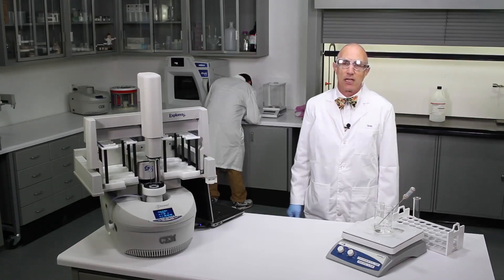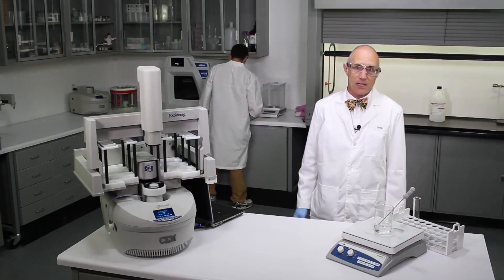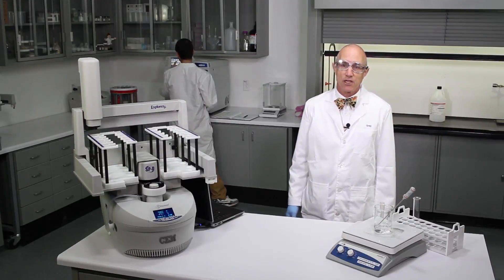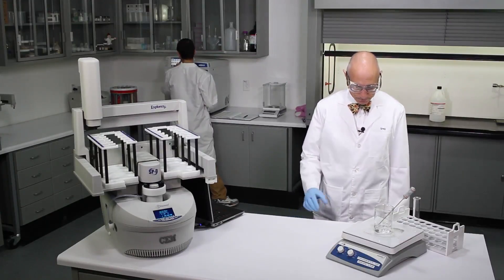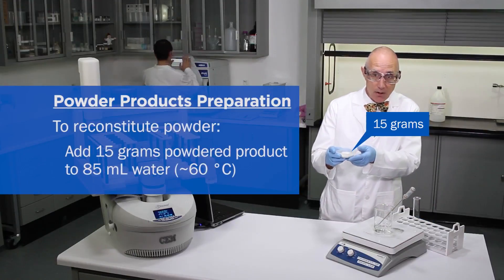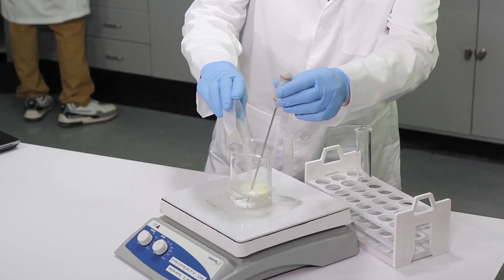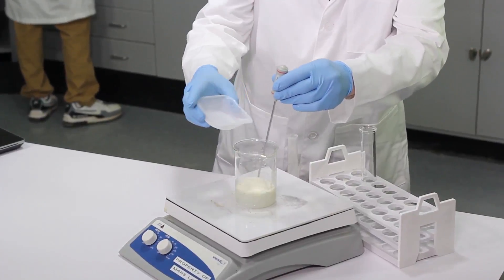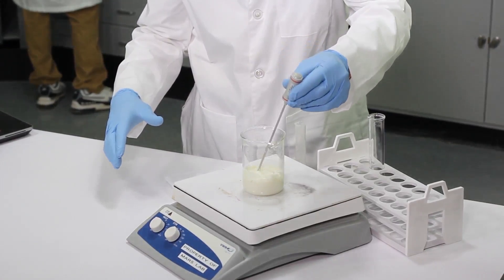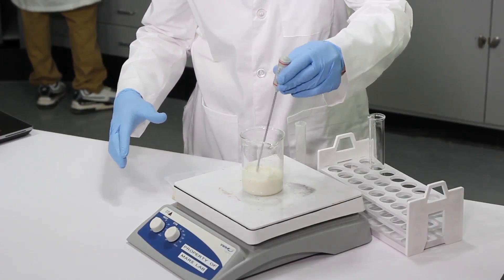When prepping samples like cheese powder, milk powder, or any spray-dried product, you have to get a homogeneous sample. Interestingly, powders are not homogeneous. So in order to get a good representative sample, we do a reconstitution. To reconstitute this cheese powder, I'm going to take 15 grams of cheese powder and 85 mL of water, add it directly in there, and let it stir at about 65 degrees C for five minutes to reconstitute it.